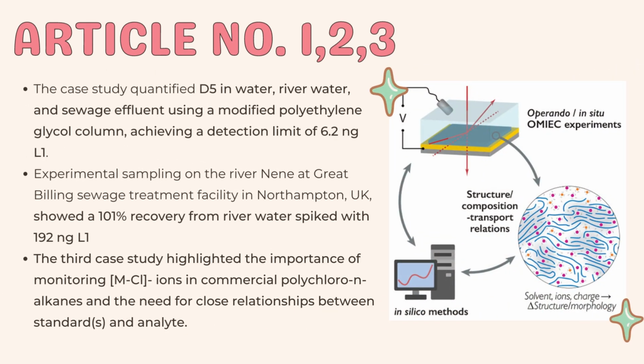I will discuss the data and results for the case study on gas chromatography. The case study quantified D5 in water, river water, and sewage effluent using a modified polyethylene glycol column, achieving a detection limit of 6.2 ng/L. It also investigated potential sewage effluent contamination with 5 target drugs from 1998 until 1999.